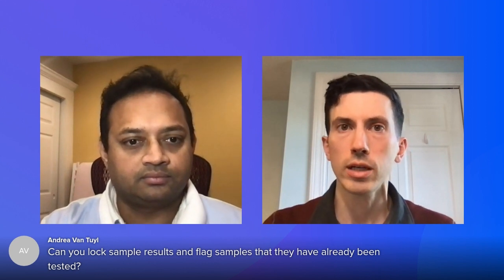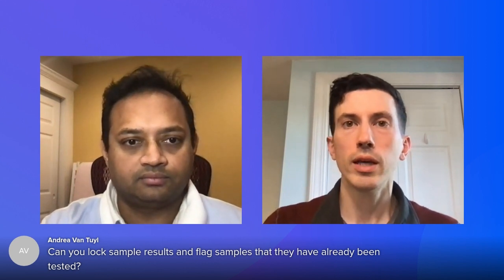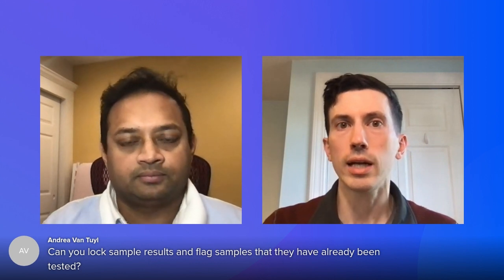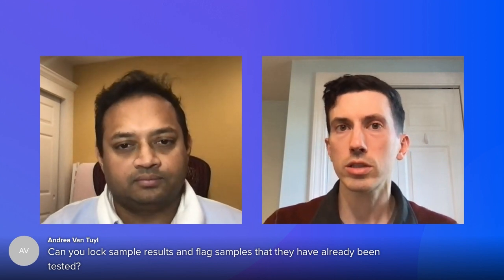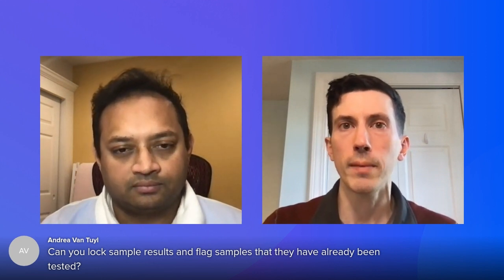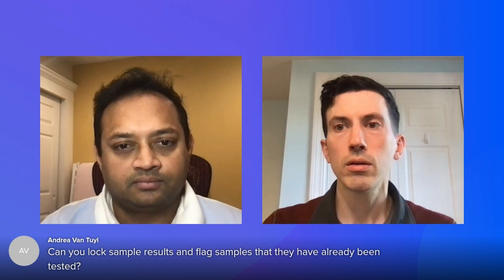So if you have a specific metric, then it can create a pass/fail criteria, and it's not editable by the user. It's really just about what the data are, and how they match up to the standard.